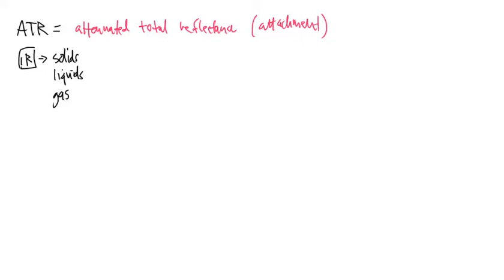Our ATR instrument was about $18,000. It was almost as much as the instrument itself. So that gives you an idea of how much money can be invested into an ATR attachment. However, again, it makes your job much easier when it concerns the analysis of an organic compound.